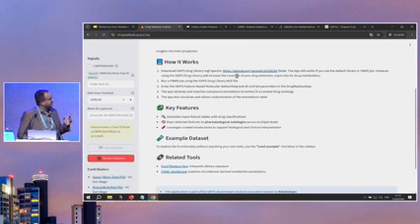But if you click on the first one, which is the Zenodo link, you're going to have access to all the libraries, so the drug analogs, the drug metabolites, and basically the parent compounds of all of these spectral libraries that are collected and that are being used to process your data on the tool.